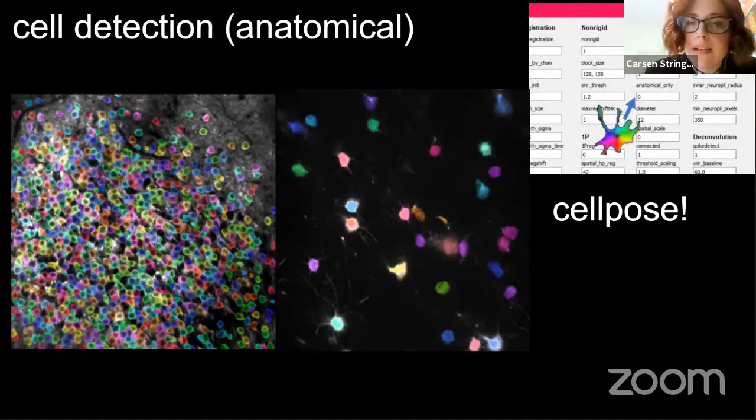Okay, and then we have another question. I'm wondering what faster than real time means. So yeah, it basically means we run an experiment that might take 3 hours, but then the Suite2P processing takes like 2 hours after that.